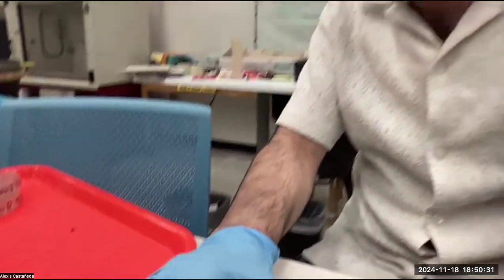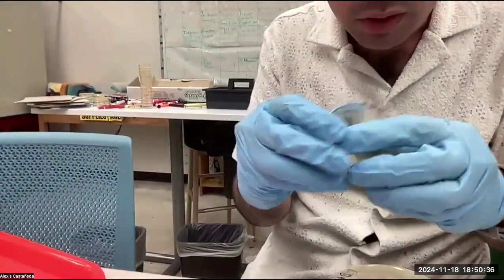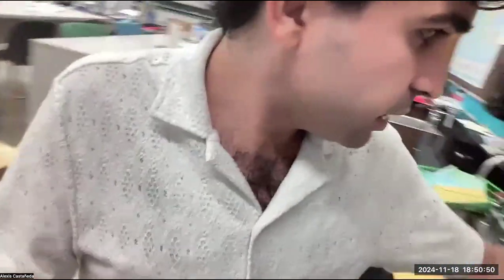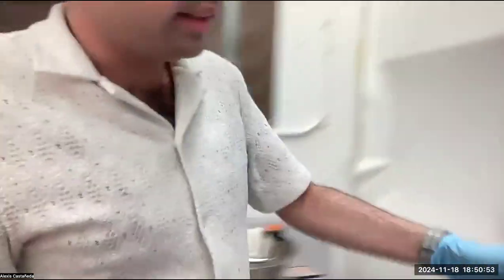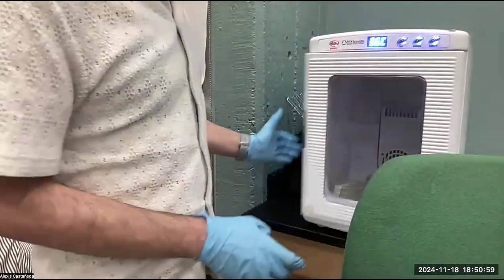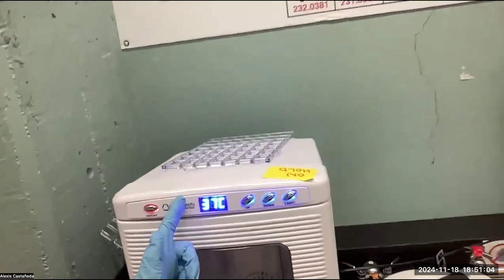Okay. So you also want to cover this mating plate. Make sure it's covered. We don't really need this anymore, but we're going to take these over to the incubator so that they can grow overnight. Again, the incubator is just where we put bacteria for them to grow. It is nice and warm on the inside, and it keeps them in the conditions that are ideal for their growth. So we'll put them right inside the incubator face down, and we'll leave them there for a day for us to check. And again, I'll just make sure that the temperature is set to 37 degrees, which is the temperature we want them to be at. So let's come back over here and let's check out what we've got going on.